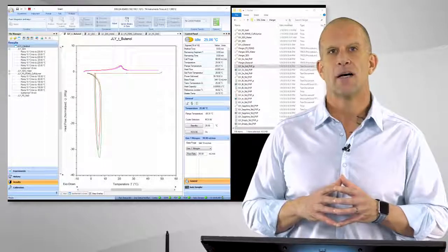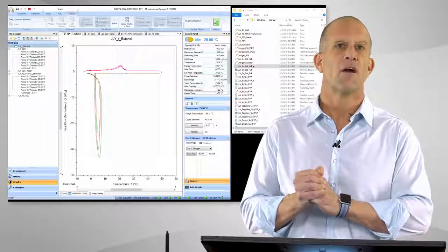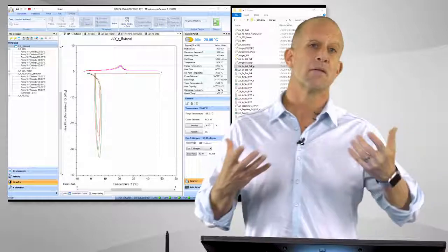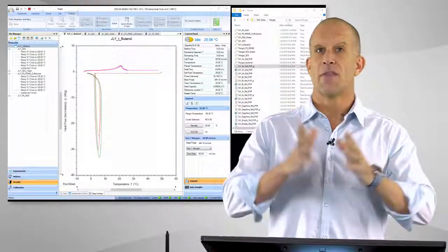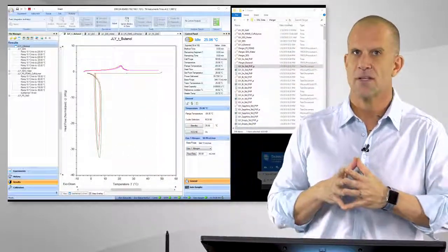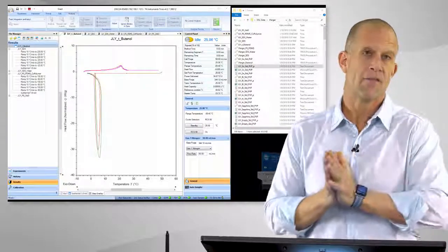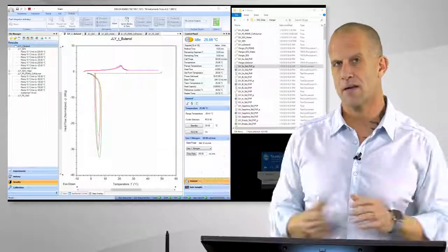And we have a DSC, a differential scanning calorimeter, a fairly new one from TA Instruments, a DSC 2500, that has a fully automated mode where you can run the instrument remotely. You can load a lot of samples on there, up to 50 to 100 different samples, all by putting them on an auto sampler and having it mechanically move the samples into and out of the calorimeter. So you can literally load it up and run it for weeks and weeks at a time.